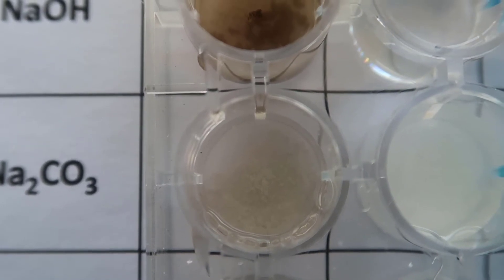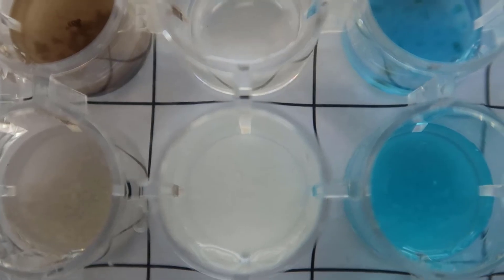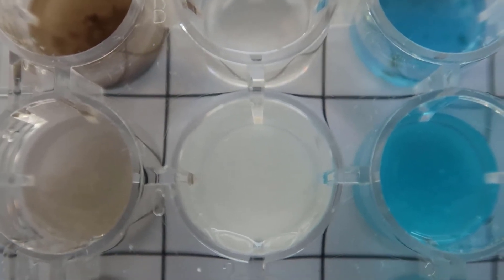Next, I'll look at the Na2CO3 row. Again, this looks a little cloudy, a little bit milky.